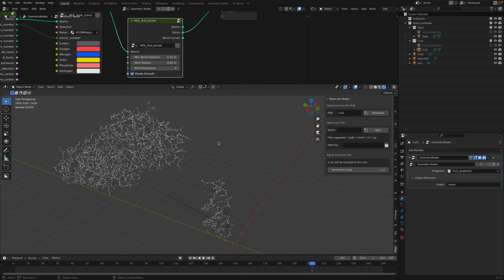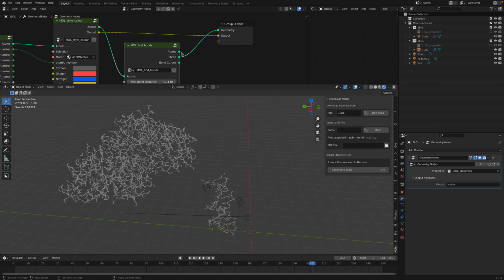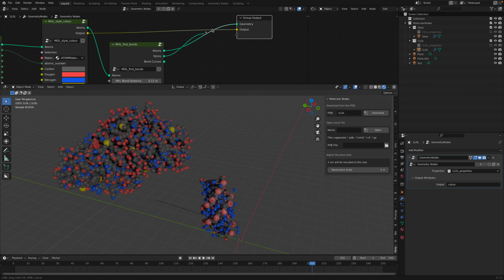Imagine if you look at data like maybe Twitter data or Facebook data, and find the connection between you and other users. It's probably gonna look like this atomic. So we have the atom, and we can create the stick.